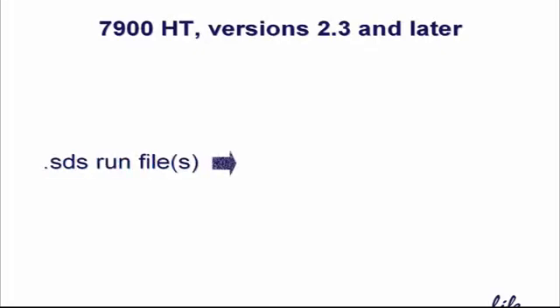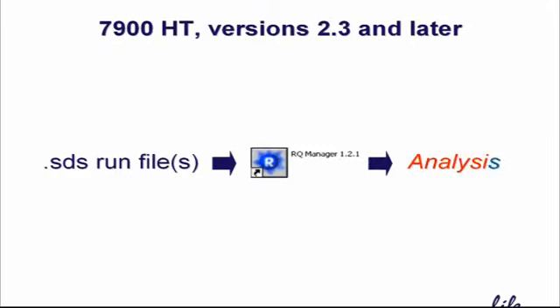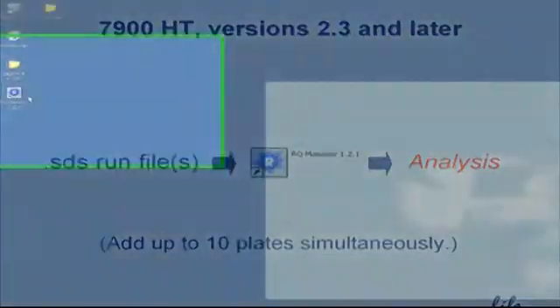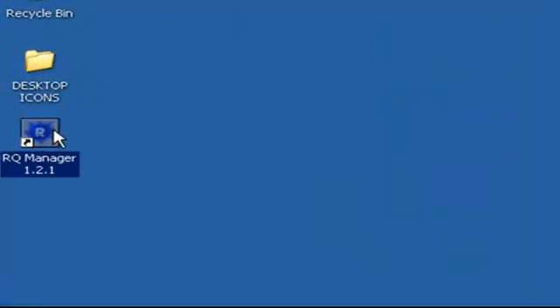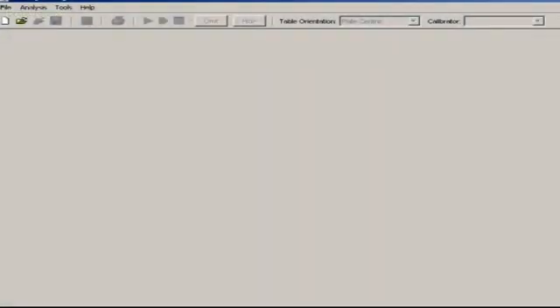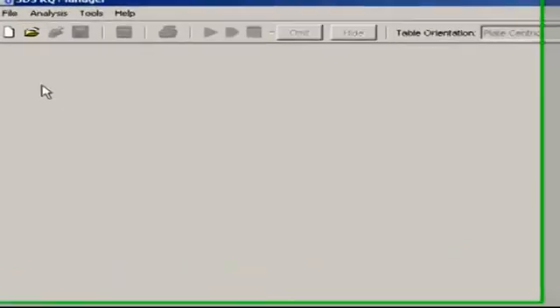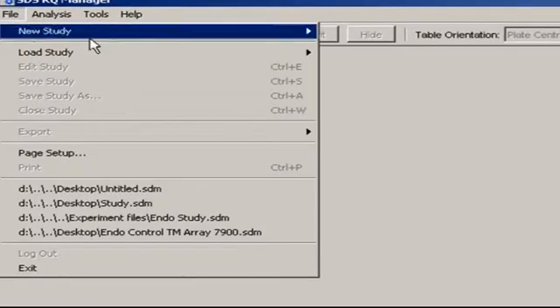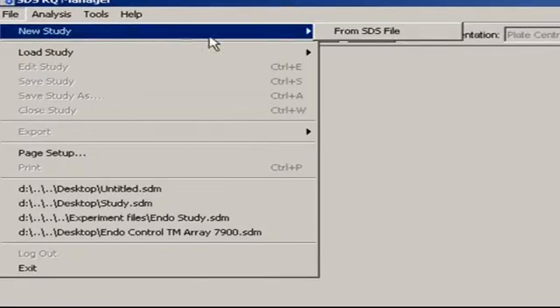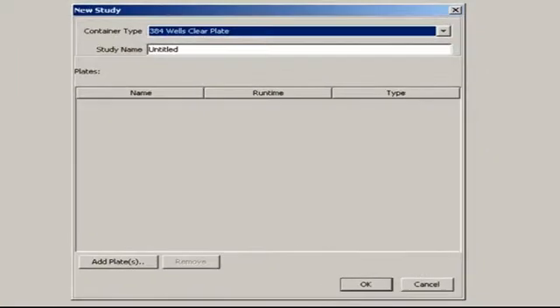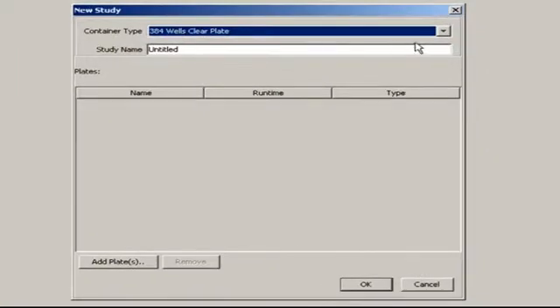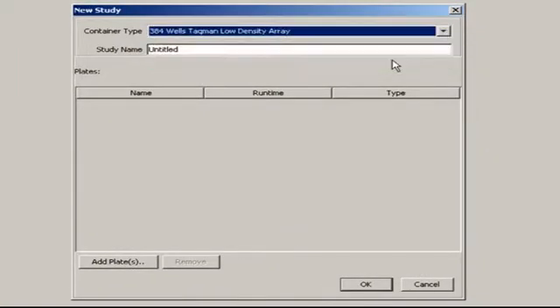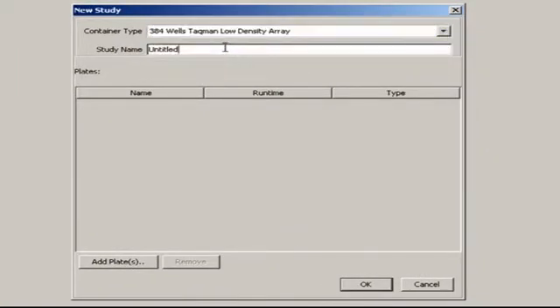The 7900HT software, version 2.3 and later, uses an intermediate program to create study files. It's called RQ Manager. Here's how it works. From the home screen, go to File, New Study, From SDS File. Choose the correct container type first. Give this study a unique name.